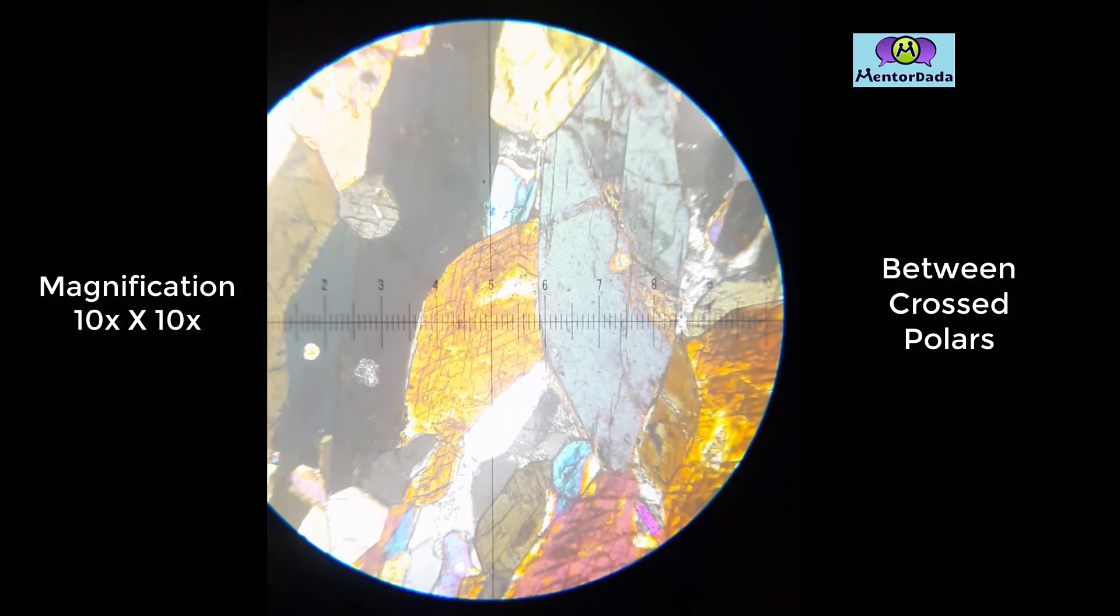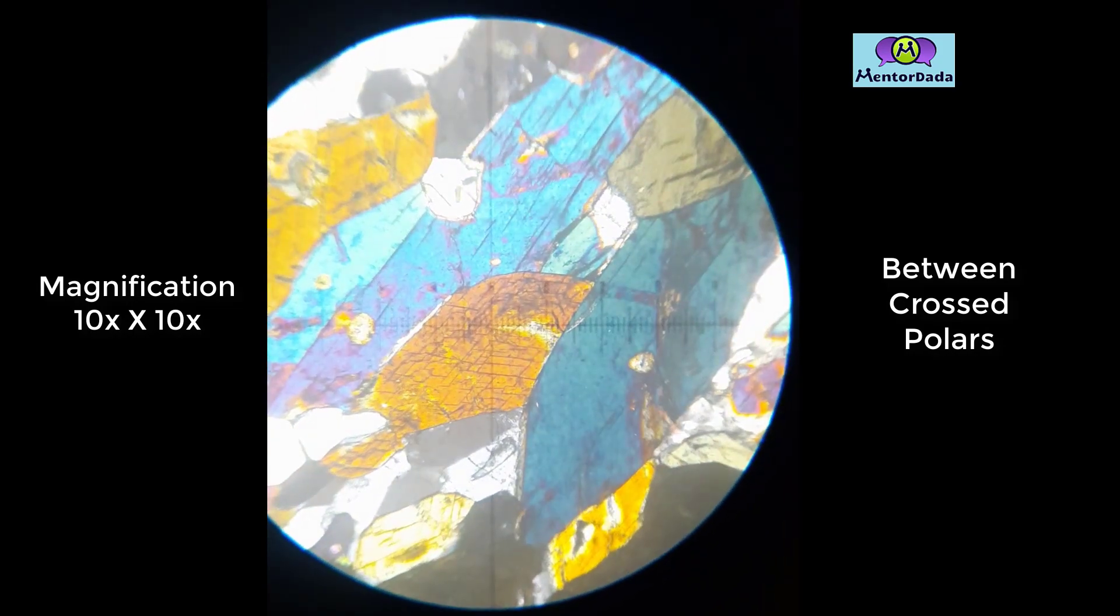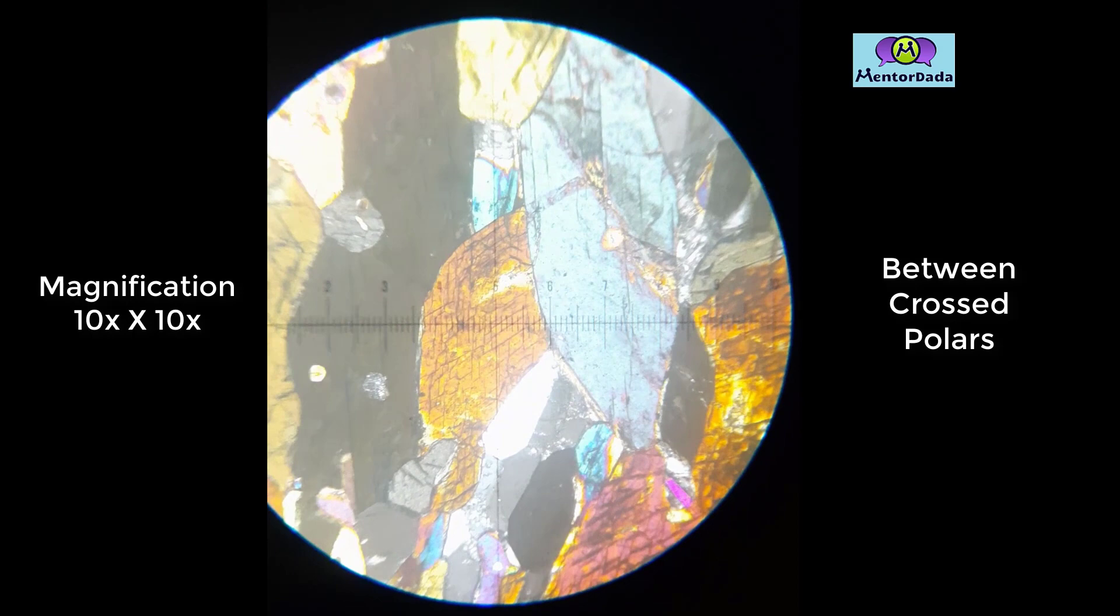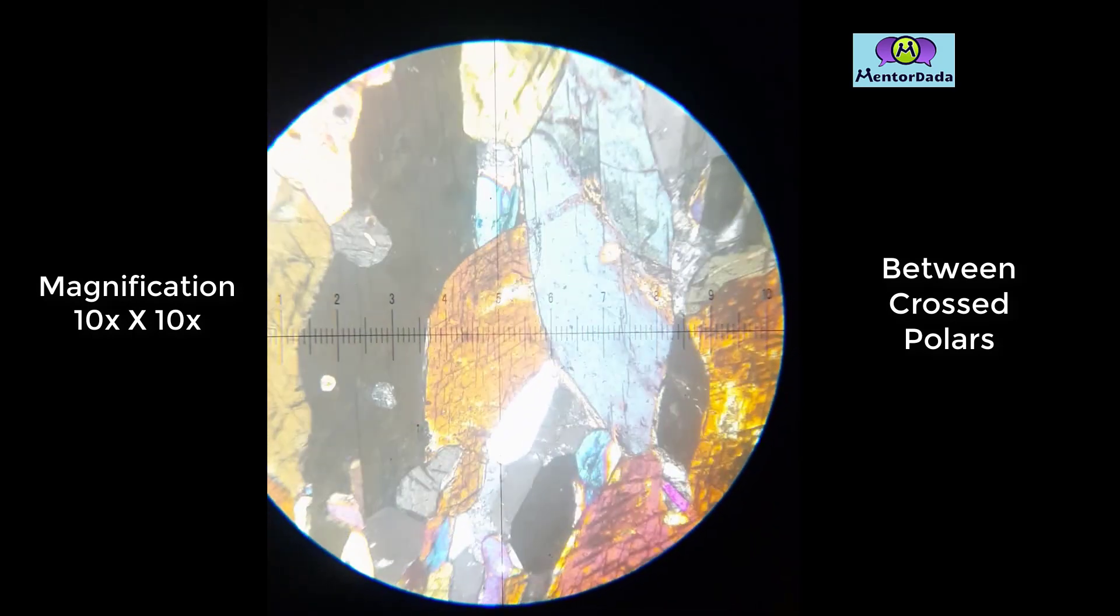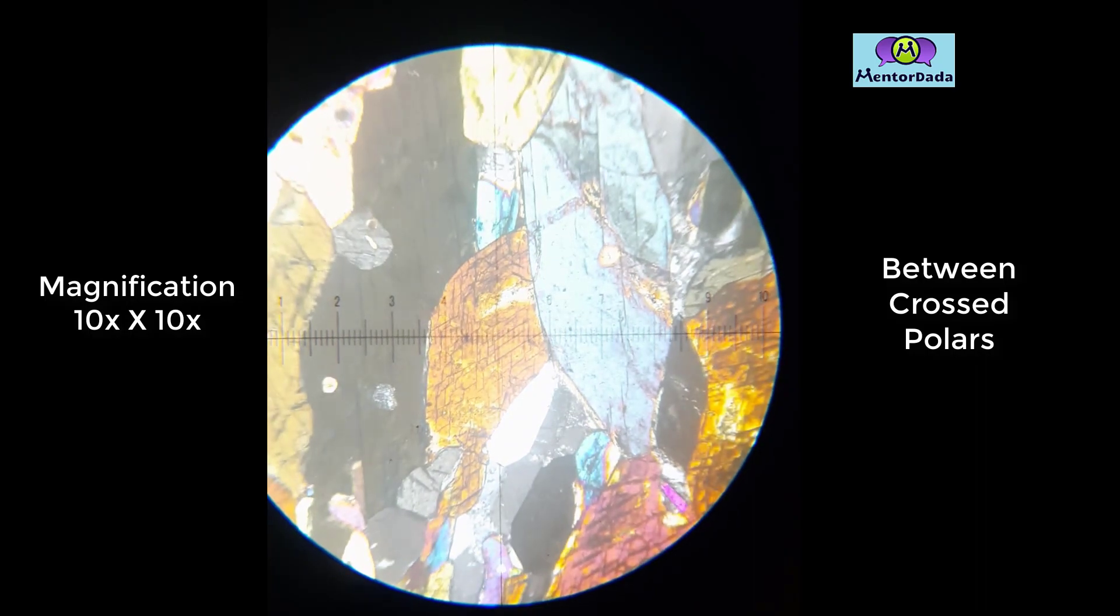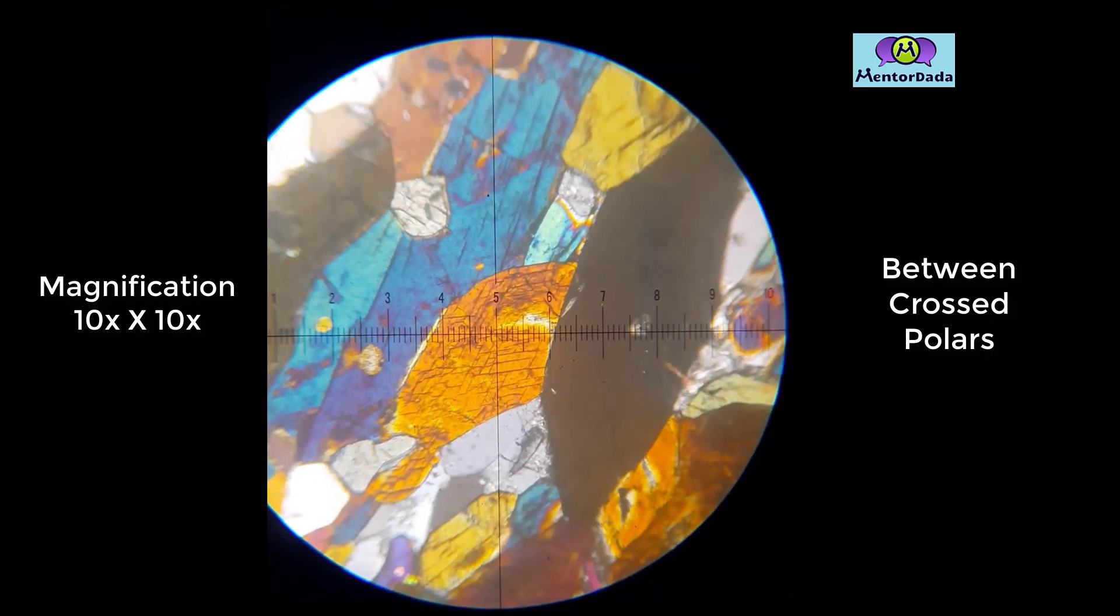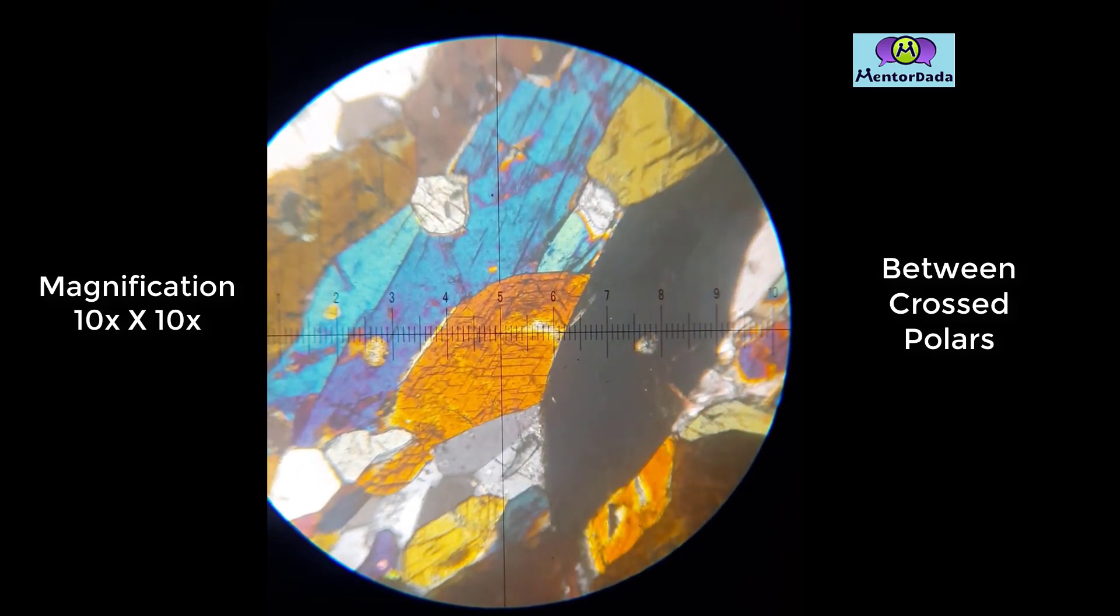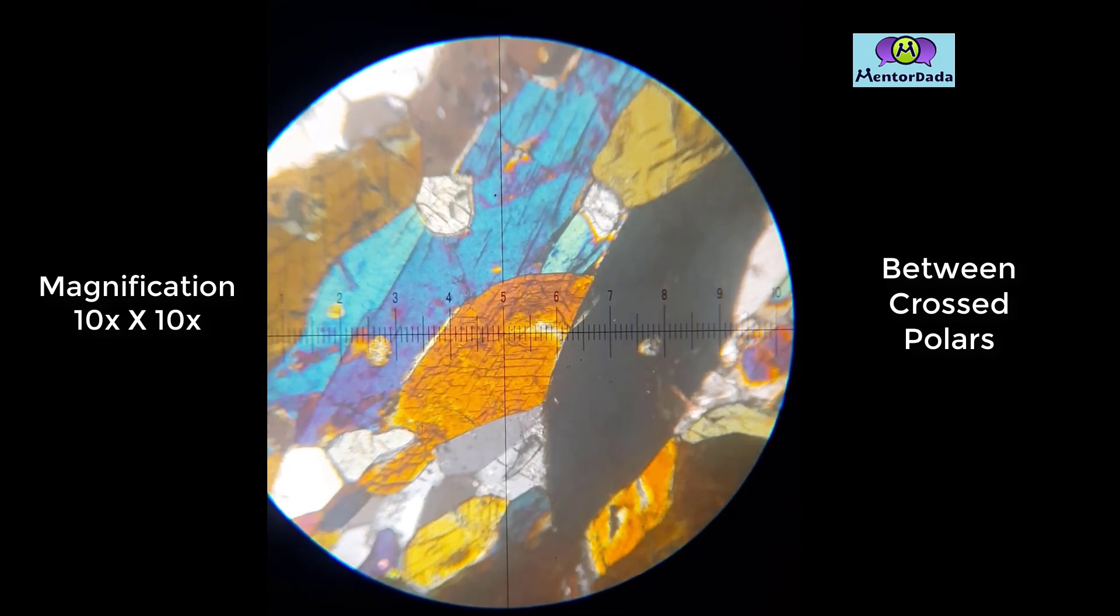As the stage is rotated, the mineral is changing its color between cross polars, so the mineral is anisotropic. At this position, one set of cleavage is parallel to the polarizer direction of the microscope and the mineral is not in its extinct position, so the mineral is not showing straight extinction.